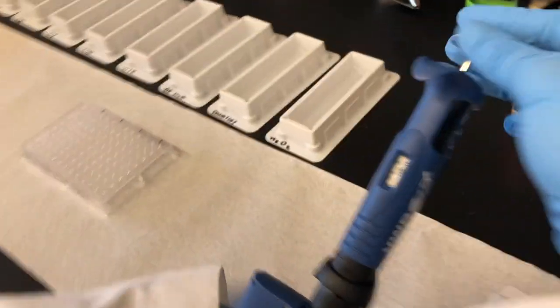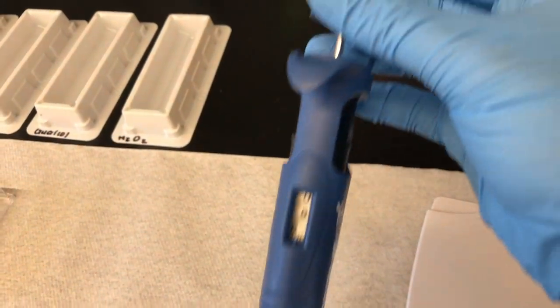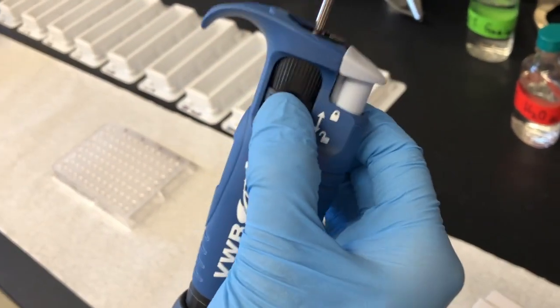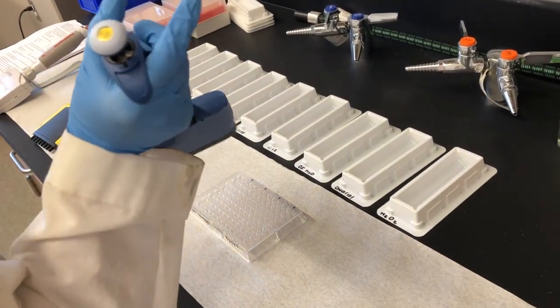I am going to show you how to set the multi-channel micro pipette to the appropriate volume. We are going to add 94 microliters of DI water to the odd number columns. I chose the 20 to 200 microliter pipette. Be sure to lock the micro pipette as demonstrated.